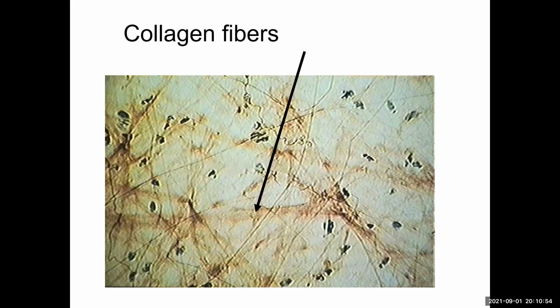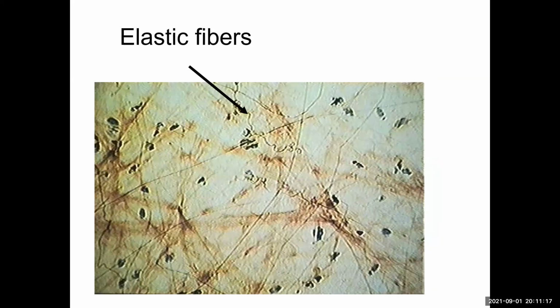So there's our collagen fiber. It's the biggest of the three types of protein fibers. Protein fibers, three types: collagen, reticular, elastic. Know those. Collagen, reticular, elastic. Collagen is the strongest and largest. It does not branch. Here's an elastic fiber. You see it is a little bit squiggly. It's not straight. It's the smallest, but obviously it has the ability to stretch and recoil.